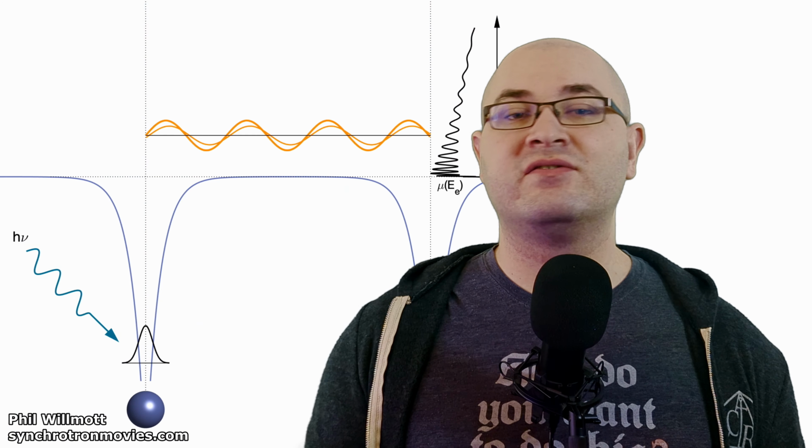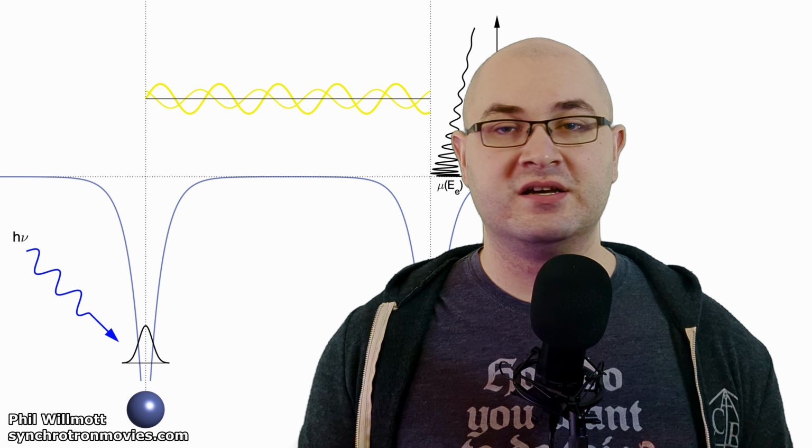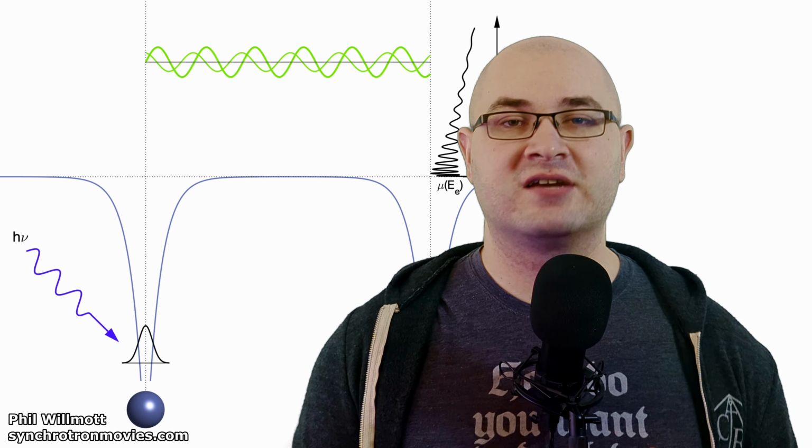The list can go on and on. These are just a few examples of how XAFS is quietly shaping our world. From better batteries to future drugs, this technique has become an indispensable tool for discovery. From mysterious wiggles on a graph to a global network of massive machines that let us watch atoms in action, the story of X-ray absorption spectroscopy is a testament to scientific curiosity and persistence. It's the story of learning to read a language we never knew existed, written in the interference of electrons.